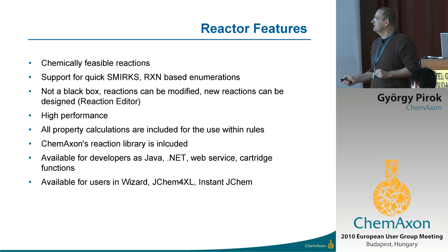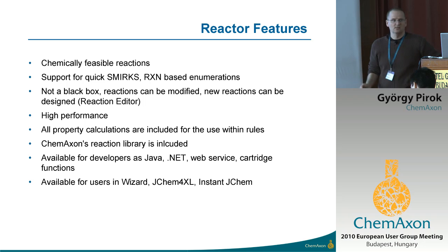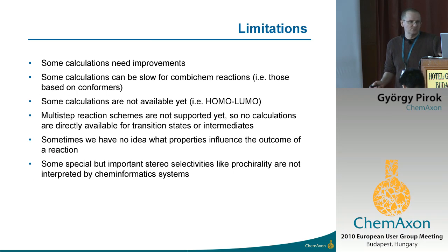We are currently working as well on the expansion of ChemAxon's reaction library. We want to cover a much larger set of the tools of organic chemistry. It is available on many platforms and we provide many applications.